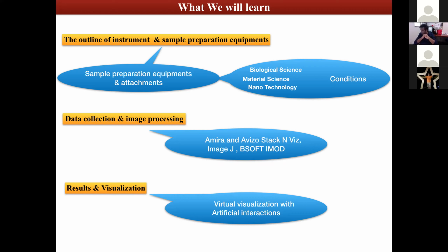You will do a part of it, in fact, say 10% of it. And the program will pick it up and do the rest of the segmentation by itself and give you the results. So it's going to save you a lot of labor, and it will be much more precise than doing it manually over the whole data set.